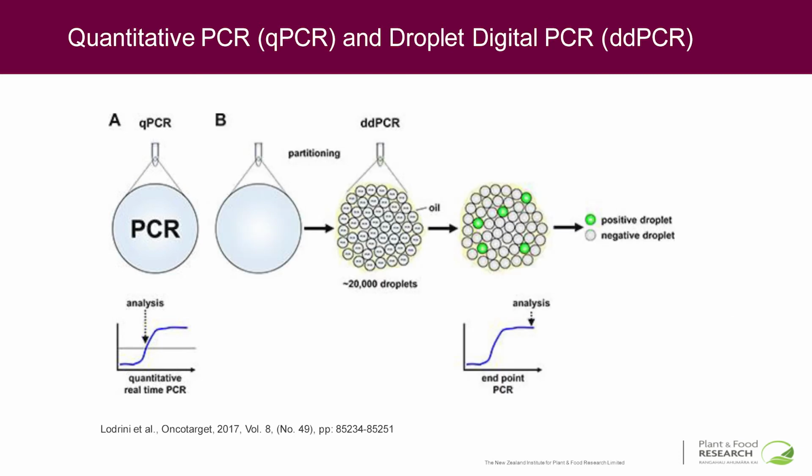Now, the new technology we've got is called droplet digital PCR. Basically, you take whatever you're investigating and mix it up, and it gets separated out and, presumably, evenly dispersed through a number of droplets. It's quite high tech. High technology has enabled you to do this. Within each of these droplets, you manufacture about 20,000 at least, thereabouts.